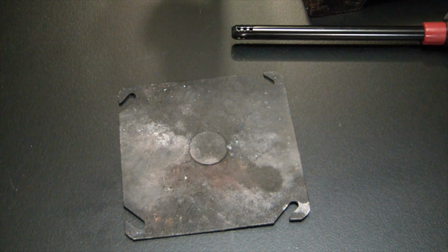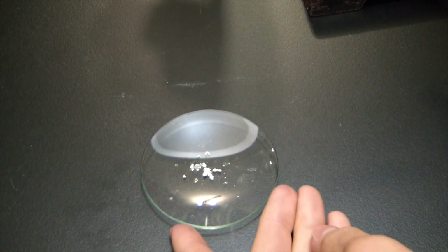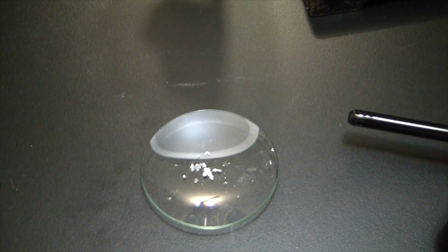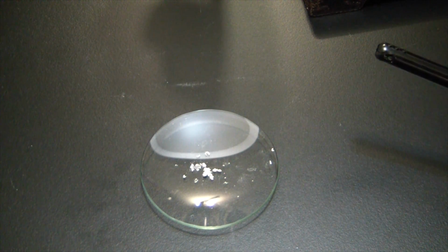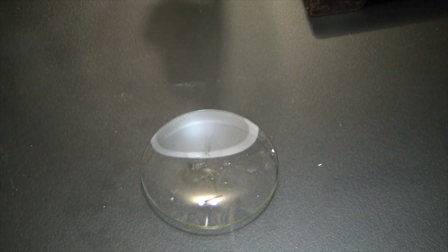Let's see what it'll actually do to the watch glass. Alright, so I've removed the bulk of the silver acetylide from the watch glass. There's still some staining, but I've got the big pile right there. Let's see if it'll shatter this watch glass. Wow. I cannot believe the watch glass withstood that. That's a testament to the borosilicate glass. That's impressive. I cannot hear out of my right ear.